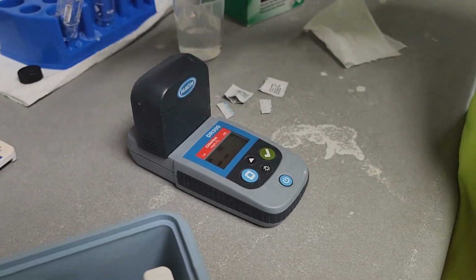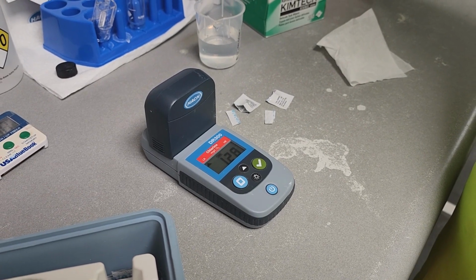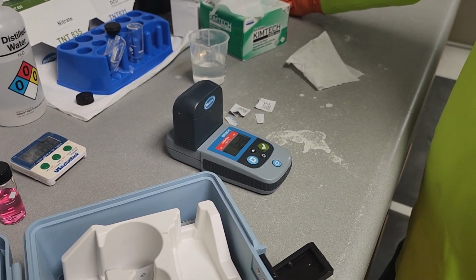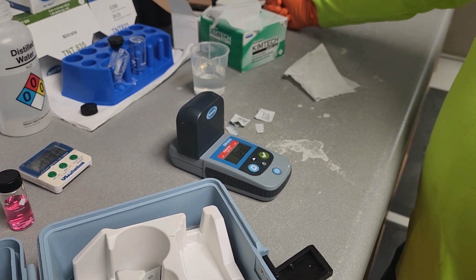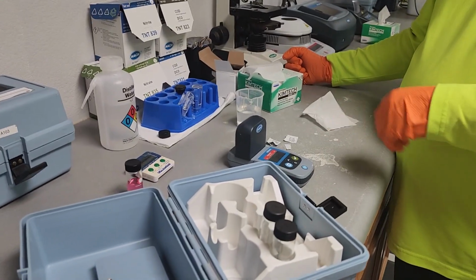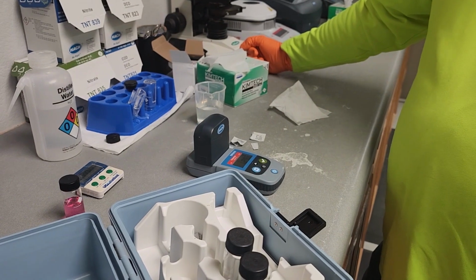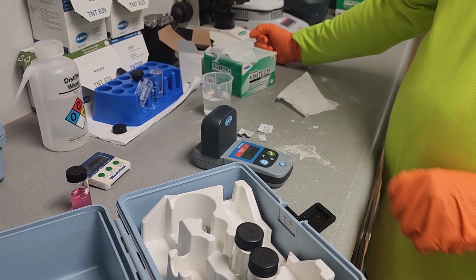See what the total residual is. 1.28. So if you take 1.28 total chlorine residual, subtract the free chlorine residual of 1.11 milligrams per liter, you end up with 0.17. So our combined residual, that is chloramines, is 0.17 milligrams per liter, and that's what we expect, because our source water is groundwater. It's not known for having bacteria and organics in it.